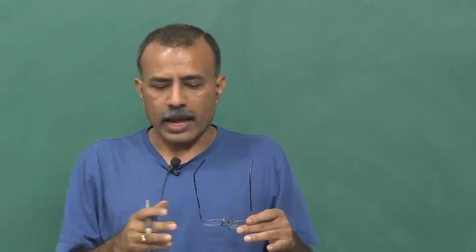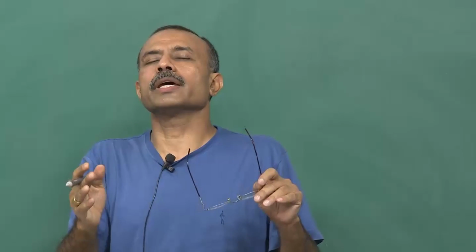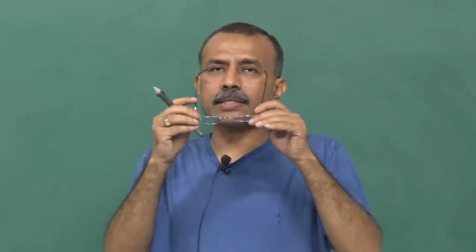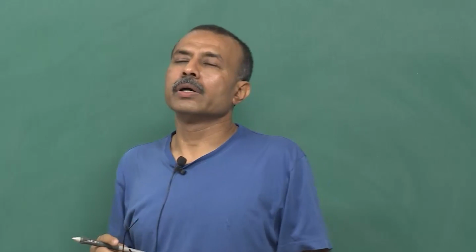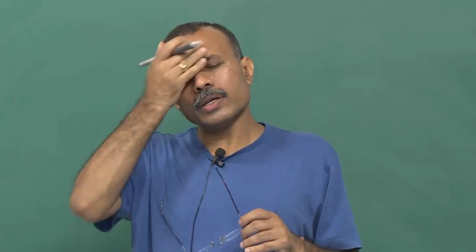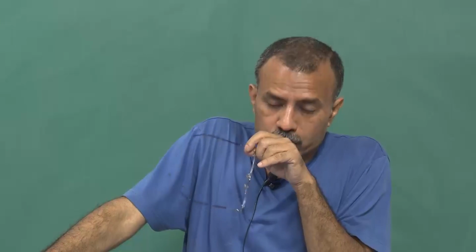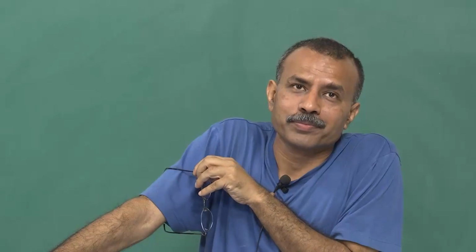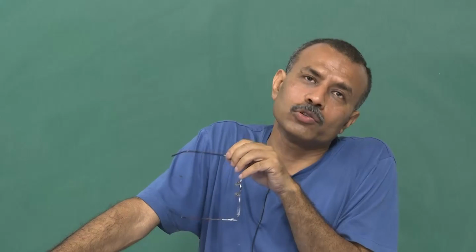So, put the logic in place. I can give you examples after examples, but that is not important. What is important is that you put the logic in place, what essentially is happening in this situation. This is the classic case of ion selective electrodes. From here, we will move on. As of now, we are only talking about the change in the potential, but there are situations where you can utilize this technique by measuring the current, and that we will see once we talk about the oxygen and the glucose electrode.